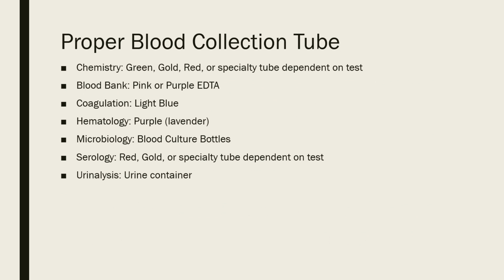So again, the department will determine what particular specimen you would be using for that department. And this right here is kind of a condensed list. There are some tests that may require something a little bit outside of this realm, but for the most part, this is kind of what you're going to see as far as the specimen that's delivered to which department.